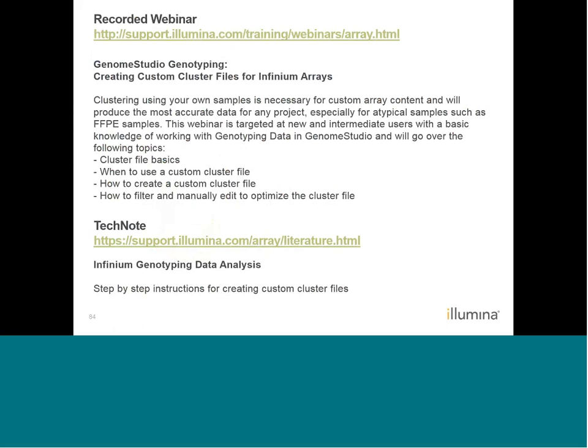I'd like to direct you to a couple of important resources. When we provide the product files for a custom array, we do not provide a cluster file. So clustering on your own samples is going to be necessary for a custom array, and it will produce the most accurate data for your project. This webinar that I describe here is targeted at new and intermediate users, but we find that even more experienced users find this to be a very helpful resource. Additionally, we have a tech note that goes step by step through those instructions for creating a custom cluster file.